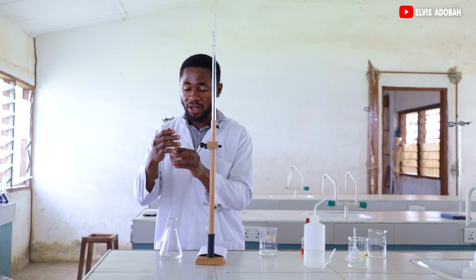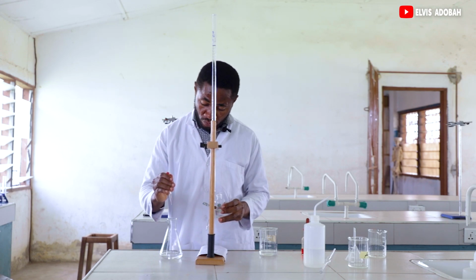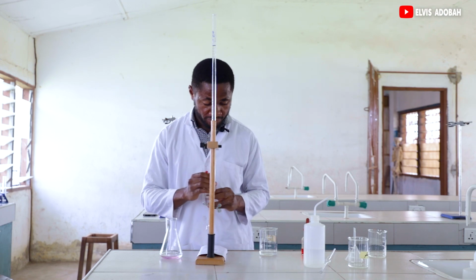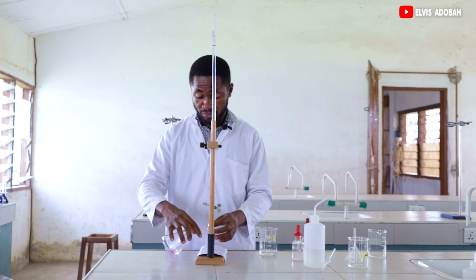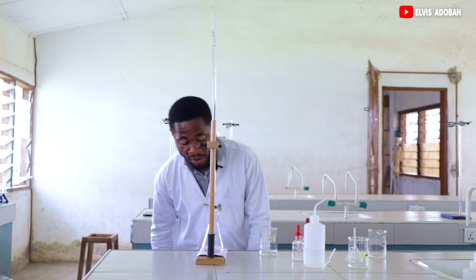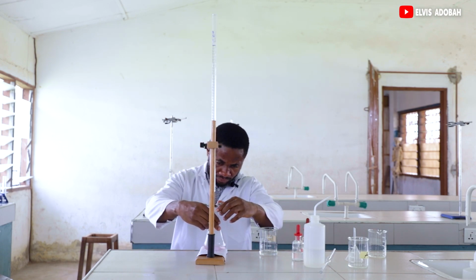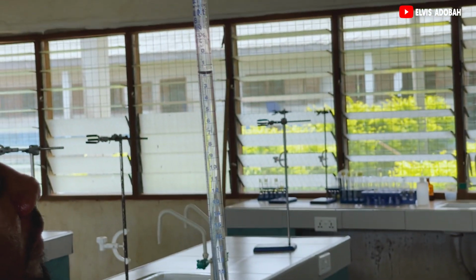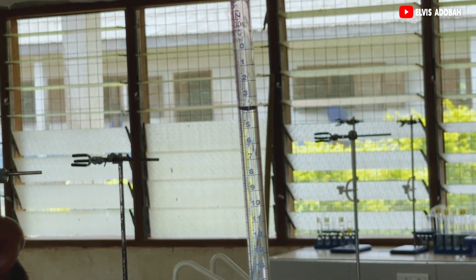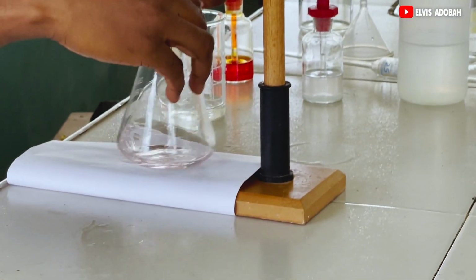Then we add our 2 to 3 drops of our phenolphthalein indicator. 1, 2, 3. Then we perform our titration till the color changes to colorless. Now, we are going to release from 0 to 4 because last time it changed at 5. Then we add dropwise.